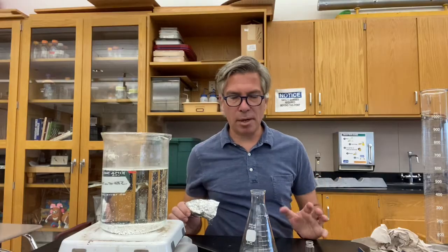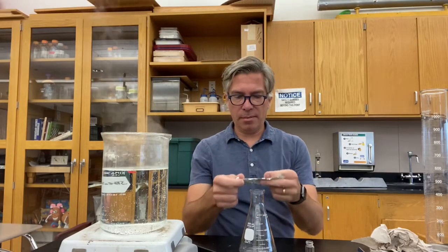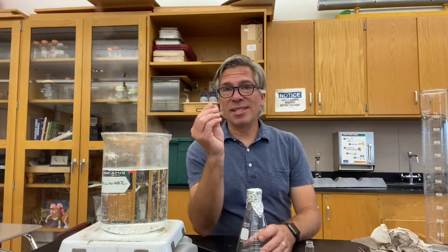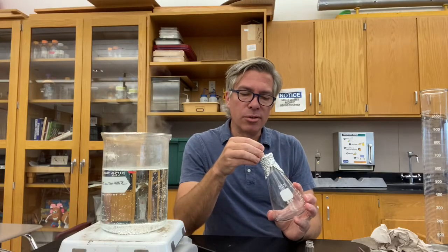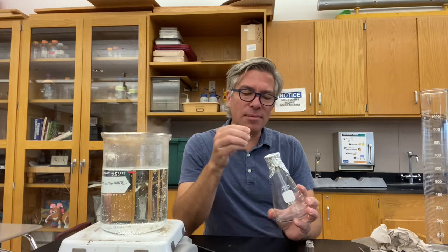Here's a pretty important part. I've got my flask with the volatile liquid in it and a piece of aluminum foil, and I'm going to cover the flask. But I need some of that volatile liquid to be able to escape, so I'm going to take a pin and poke the tiniest hole I possibly can in the aluminum foil to allow those vapors to escape, just super tiny. Oh, there we go, got it.